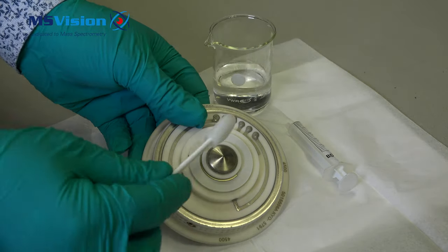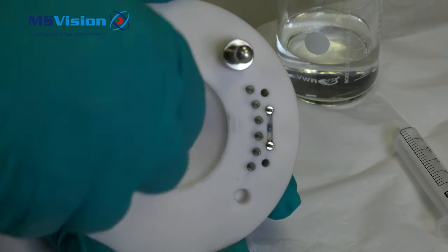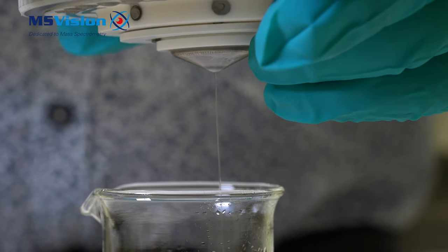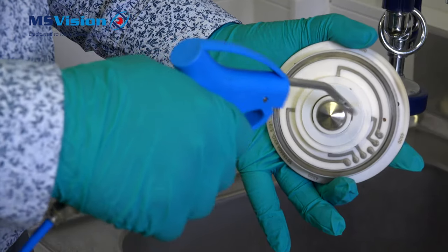To clean it, use a swab with methanol or IPA and thoroughly wipe around the orifice. Then use a syringe to push the solvent through the orifice from the back and ensure liquid flows through easily. Then dry down with nitrogen.